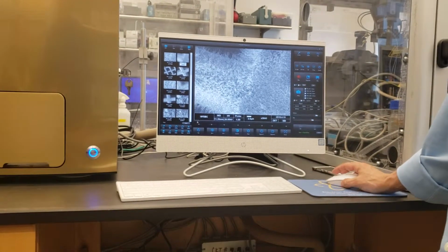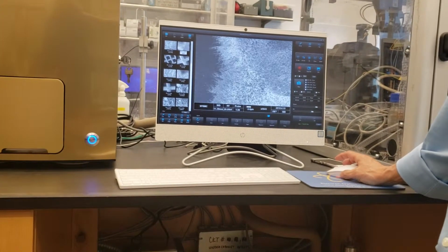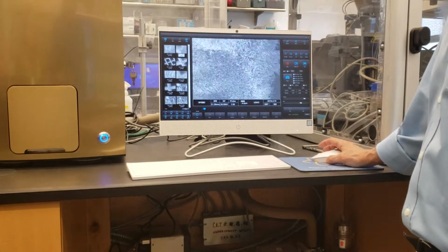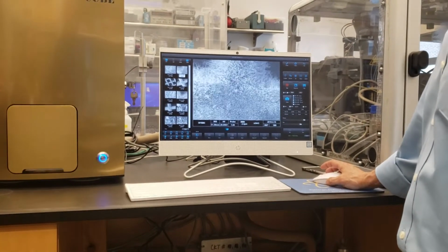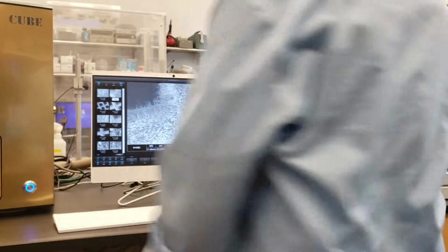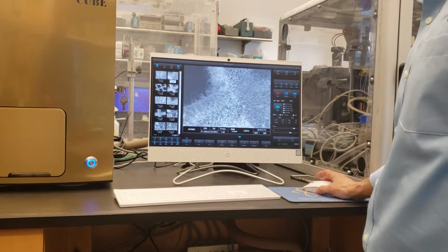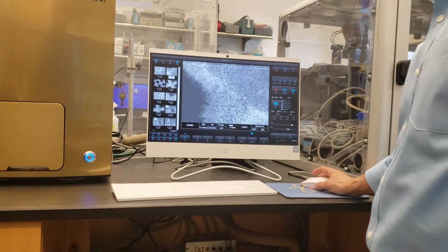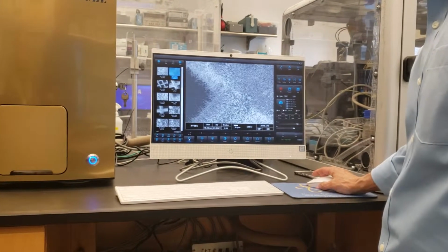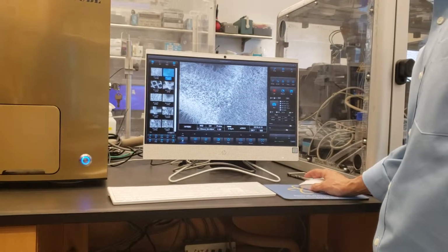Just really quick, down here is rotation. If I left click on rotation, I could rotate this 90 degrees or whatever I want, 360 degrees. It's rotating it electronically. It's rotating the beam, because right now we're at 5000x. Picture if you rotated the stage at 5000x, it would just be gone. I'm doing it electronically through the scan coils. Wherever I leave this, let's say I left it there, it gave me a value of 72. If I hold my mouse there and double click my trackball, it brings that back to 0. So if I double click, it resets it.